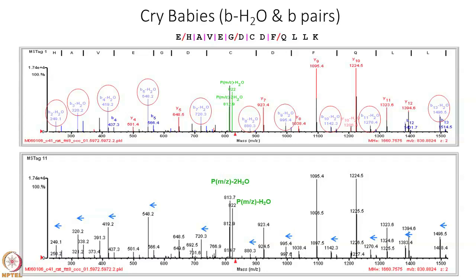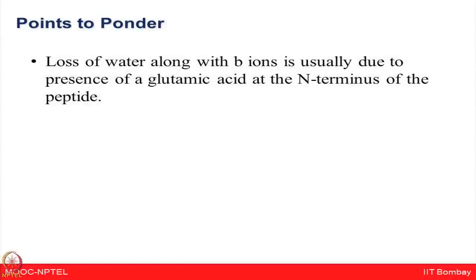Okay, the slashes I just use as nomenclature to indicate what kind of fragmentation is happening between the residues. I use a red slash to be a Y ion, a blue slash to be a B ion, a pink vertical bar means there's both. Okay, that's not a universal thing within the field, right? But it allows you, when you do a lot of this, to just look at the thing and know what's going on, okay?